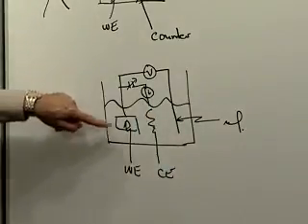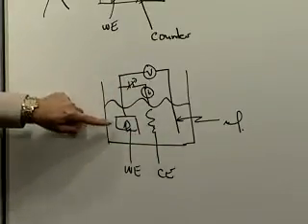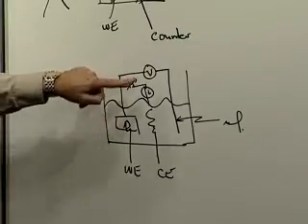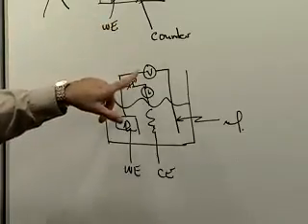Okay, so I'm passing all my charge through this loop of the circuit, but I still can monitor the potential of my working electrode versus the reference electrode. So in other words, I'm still saying, okay, sit there, watch this voltmeter, and any time this voltmeter deviates from whatever number I want on it, change this power supply, okay, so that it comes back to what I want. Now, the first thing you'll notice is there's now no longer a direct relationship between what's coming out of that power supply in terms of the voltage and what you read up here.